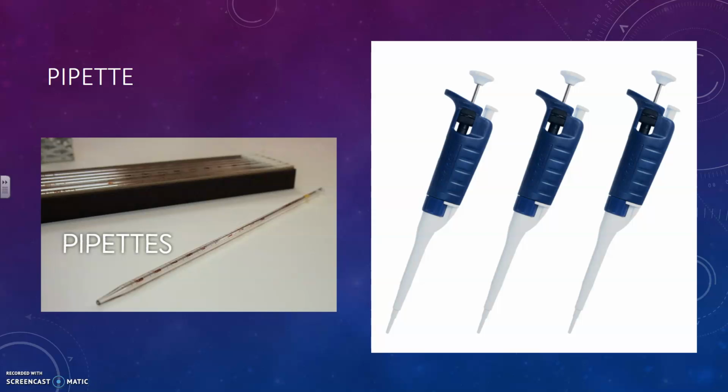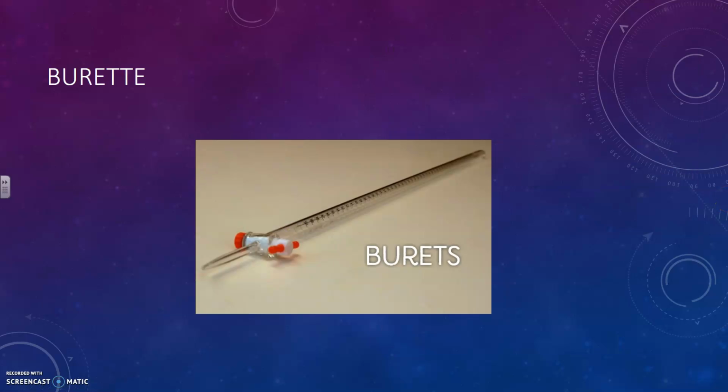So you generally see these in biochem labs and upper level, like college level laboratories. They are a lot more precise than your regular pipettes over here, and generally a lot more useful than these, as you can get like incredibly precise with them.